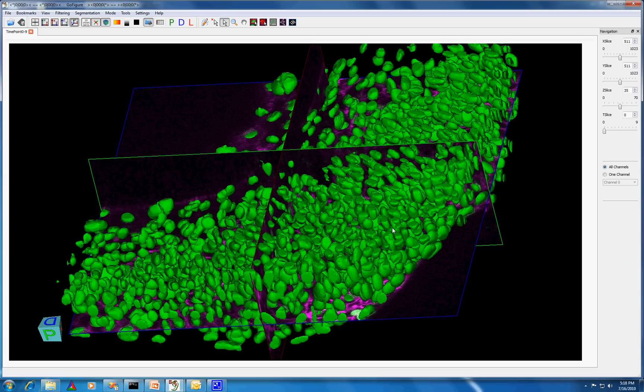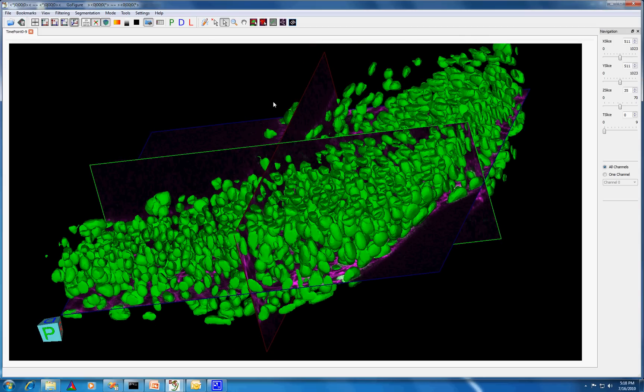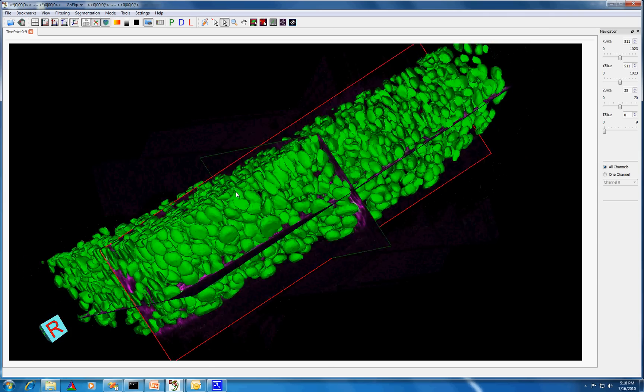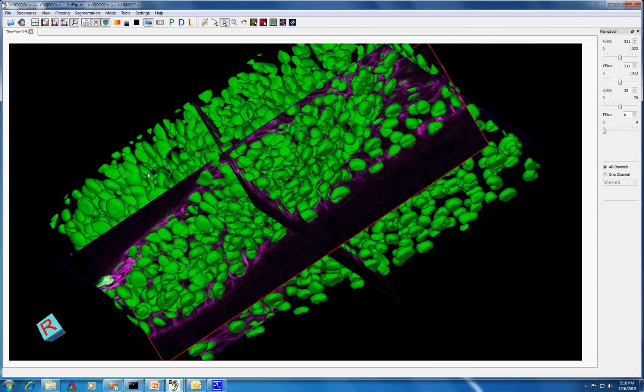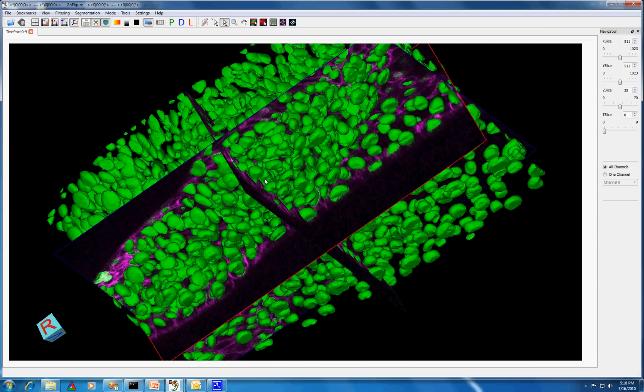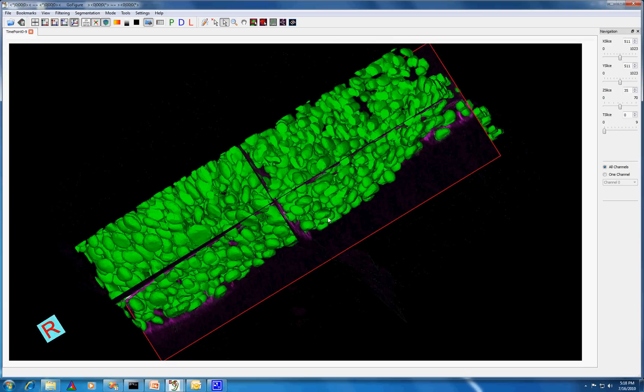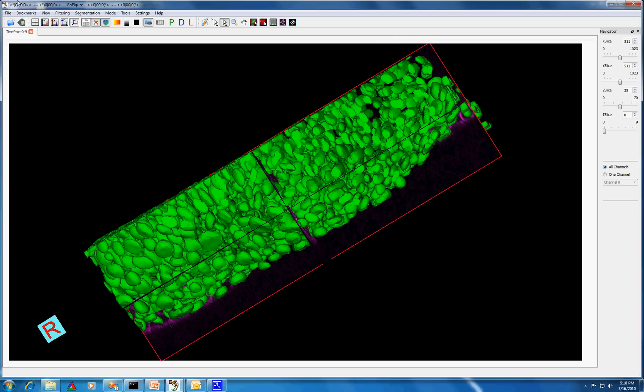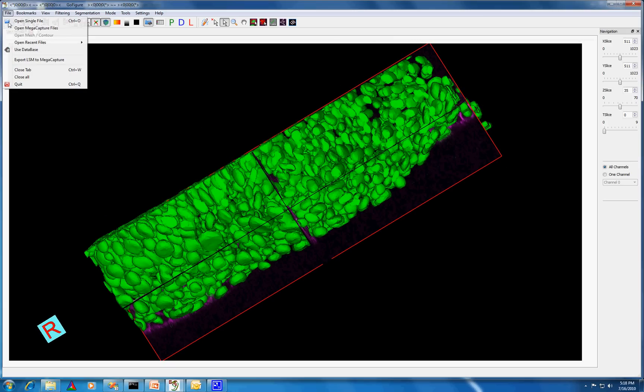We did this using a feature in GoFigure called Import 3D Meshes, which gets the information from a text file and saves the meshes in the GoFigure database. The database is a great feature because it allows you to save all the work you've done using GoFigure and start again exactly where you left off at some later time.